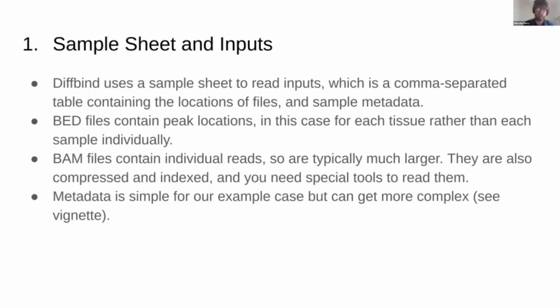And they're also indexed, which means in theory, you can read parts of the BAM file without reading every single thing in the BAM file, which is really useful for this kind of analysis where you've got peaks, so you just want to go in and take a tiny bit of the file. The ones in this tutorial are actually downsampled, so they're kind of a tenth of the coverage of the real ones. But the original reads generated sort of 15 gigabyte BAM files, which is really quite big if you want to read it all into memory.